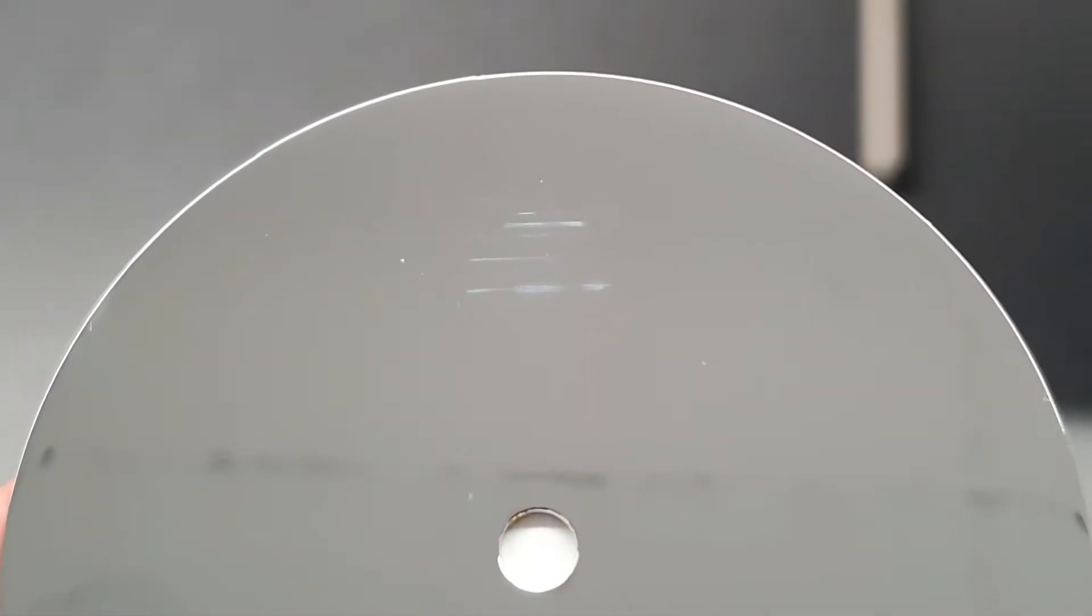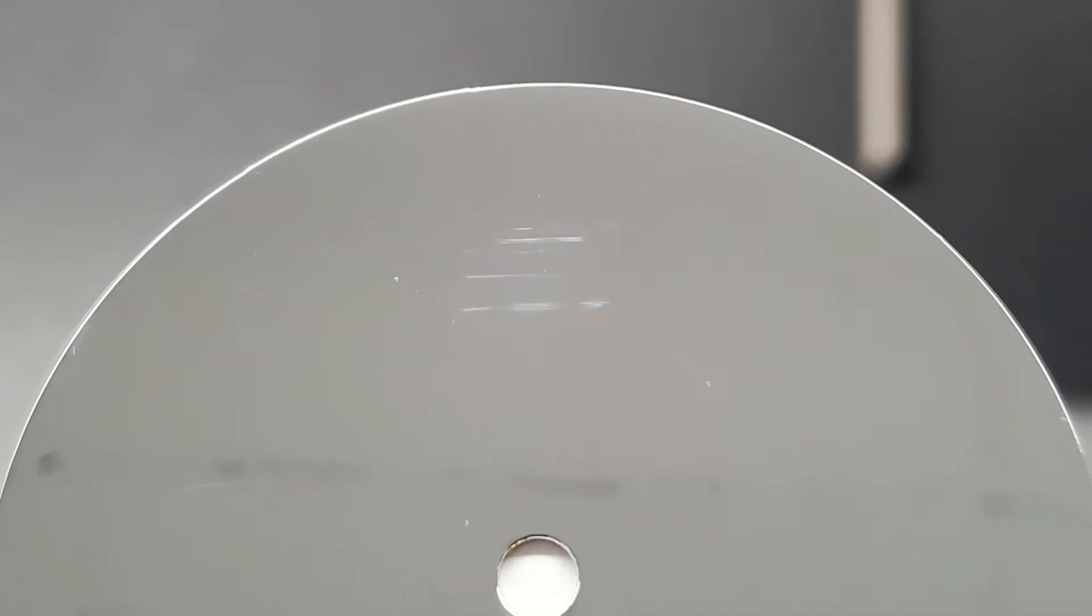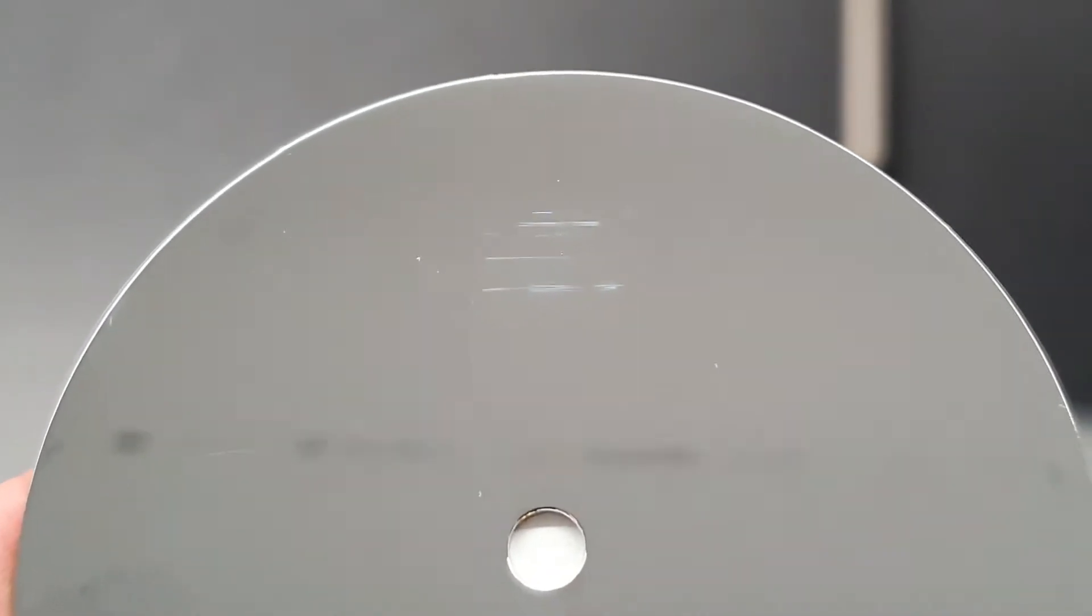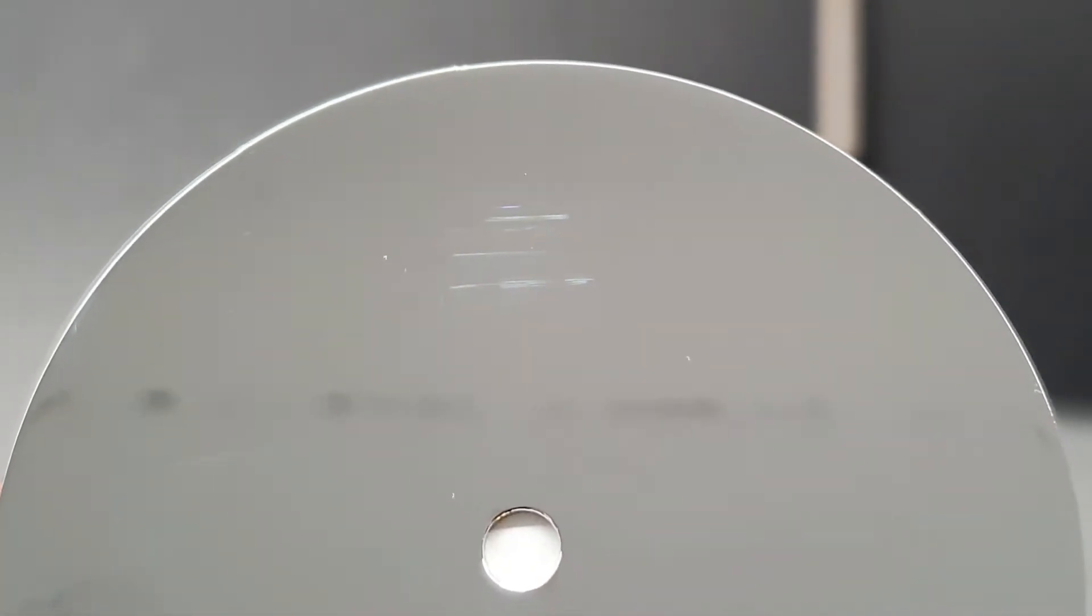What we see here is the galvanic chrome probe. We see clear scratches at the test area. However, there is no change in color whatsoever.